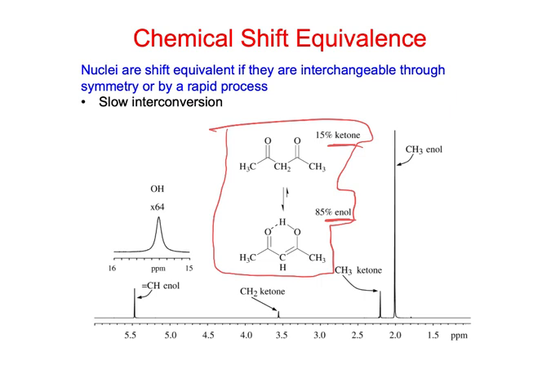Okay, in this case, this is going relatively slow, what we'd say on the NMR time scale. And the NMR time scale is kind of how fast we can sample it. Okay, so what we can actually see is both of these compounds. All right, so down here, we have the chemical shift for the enol form.